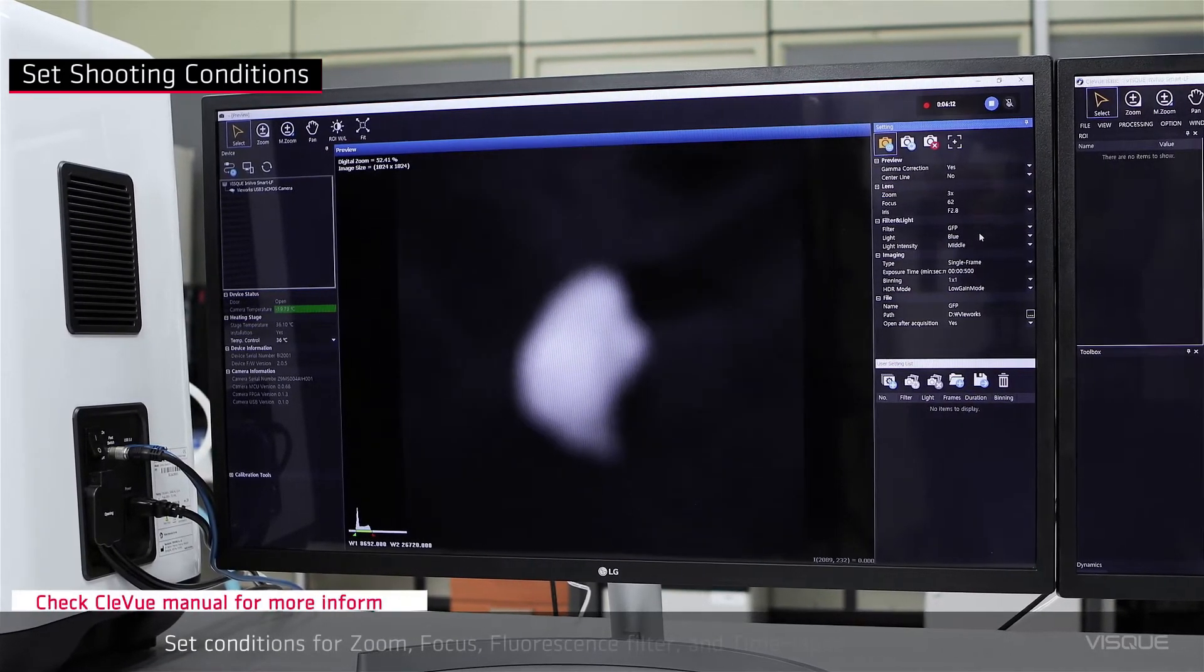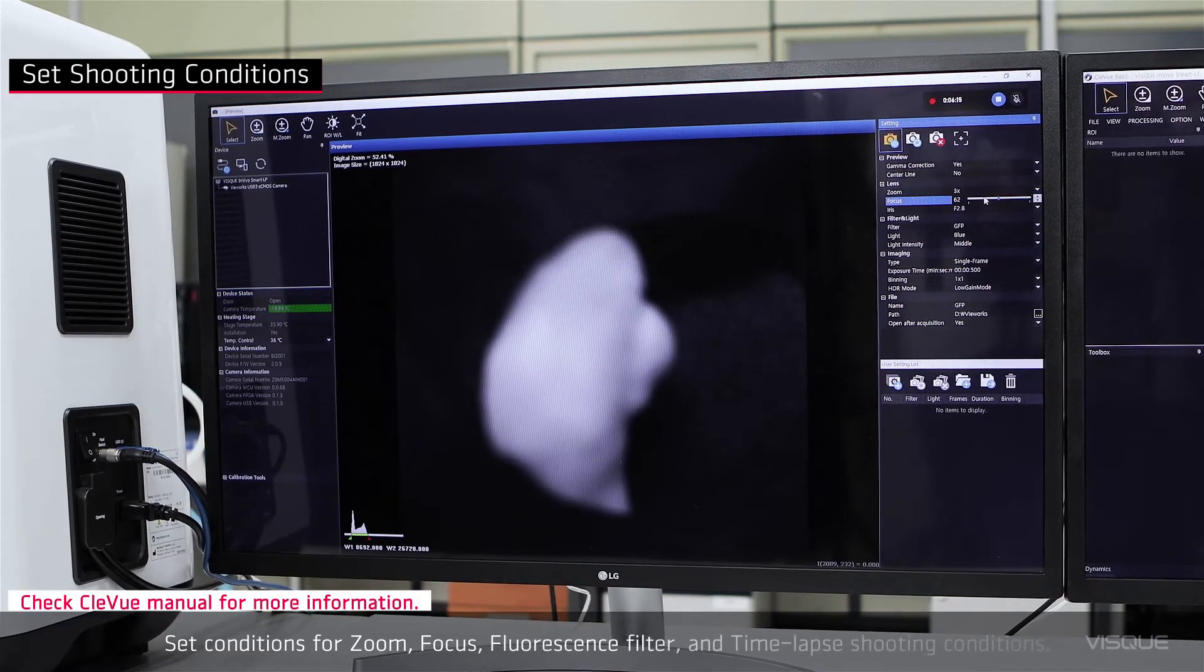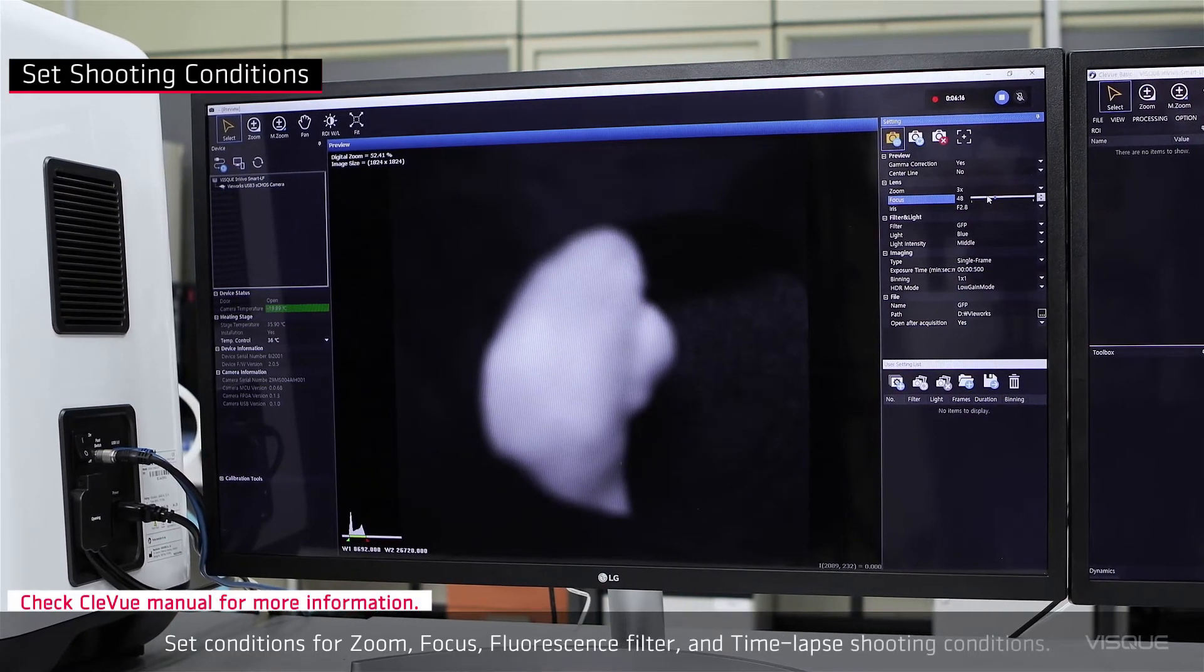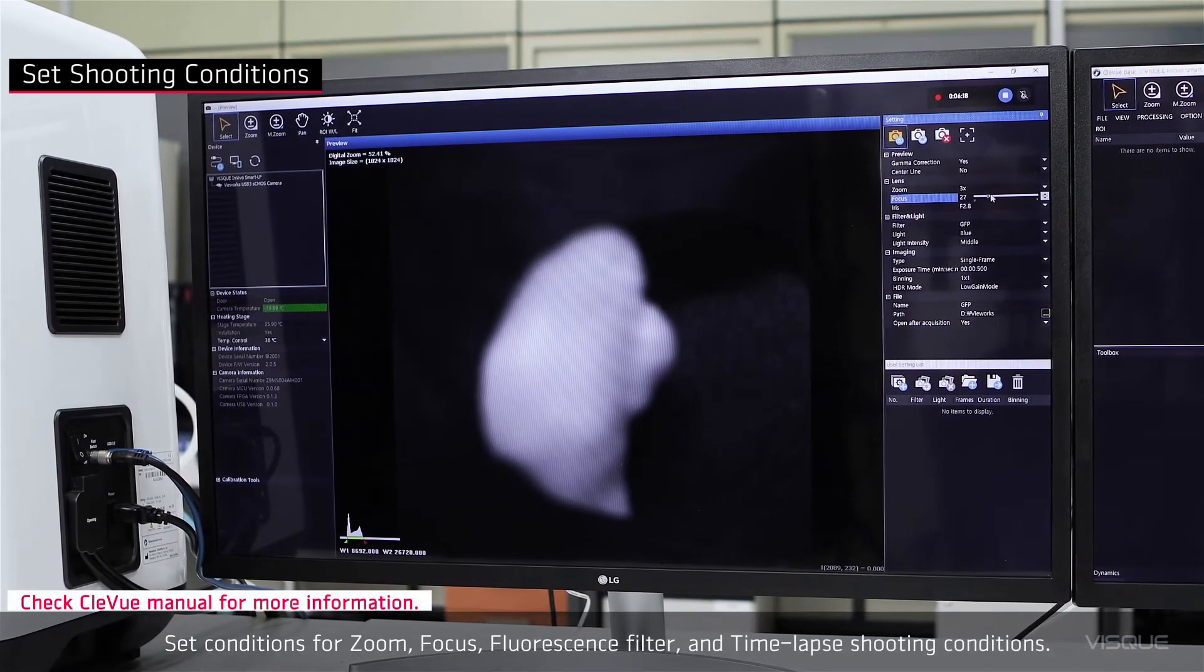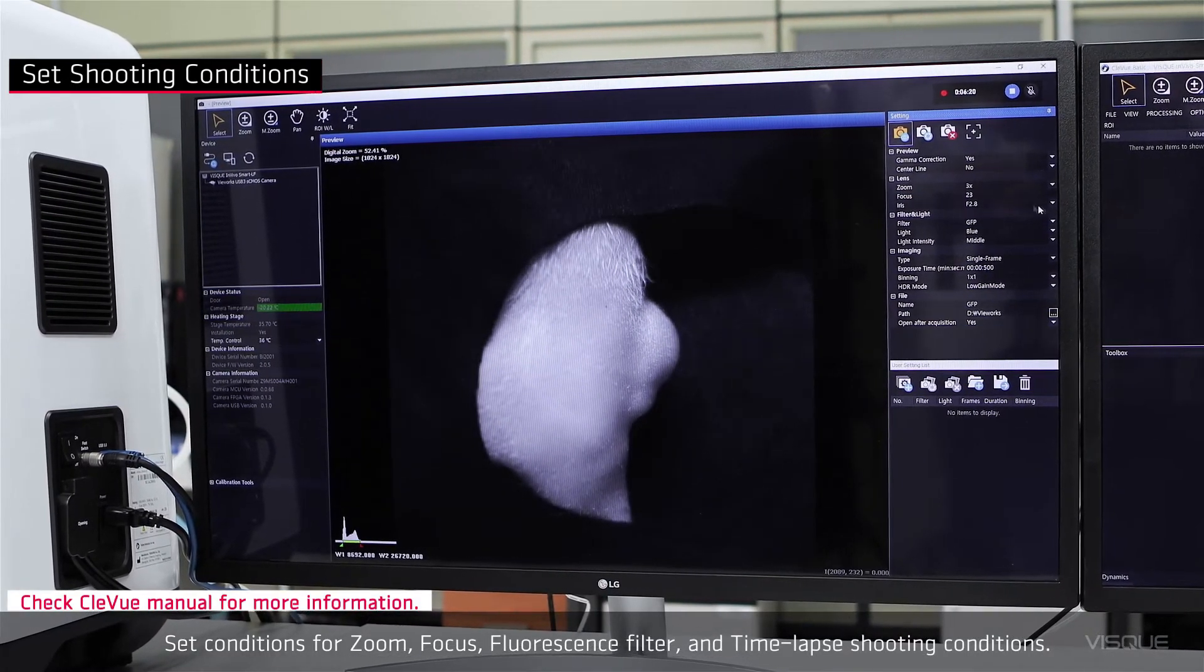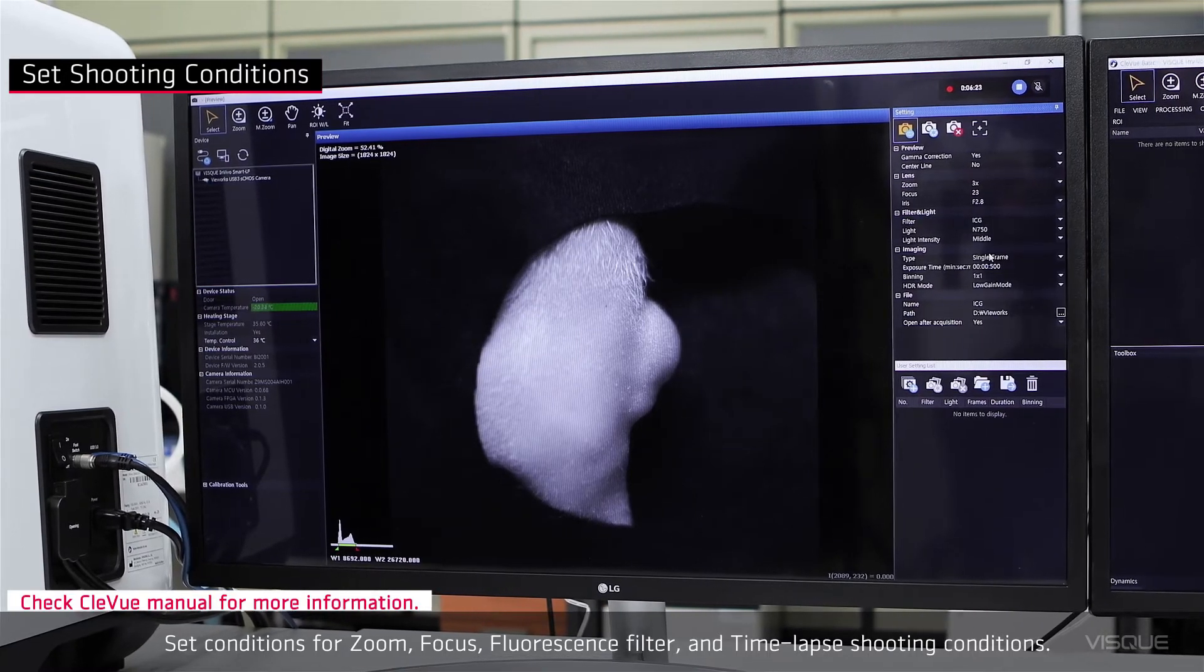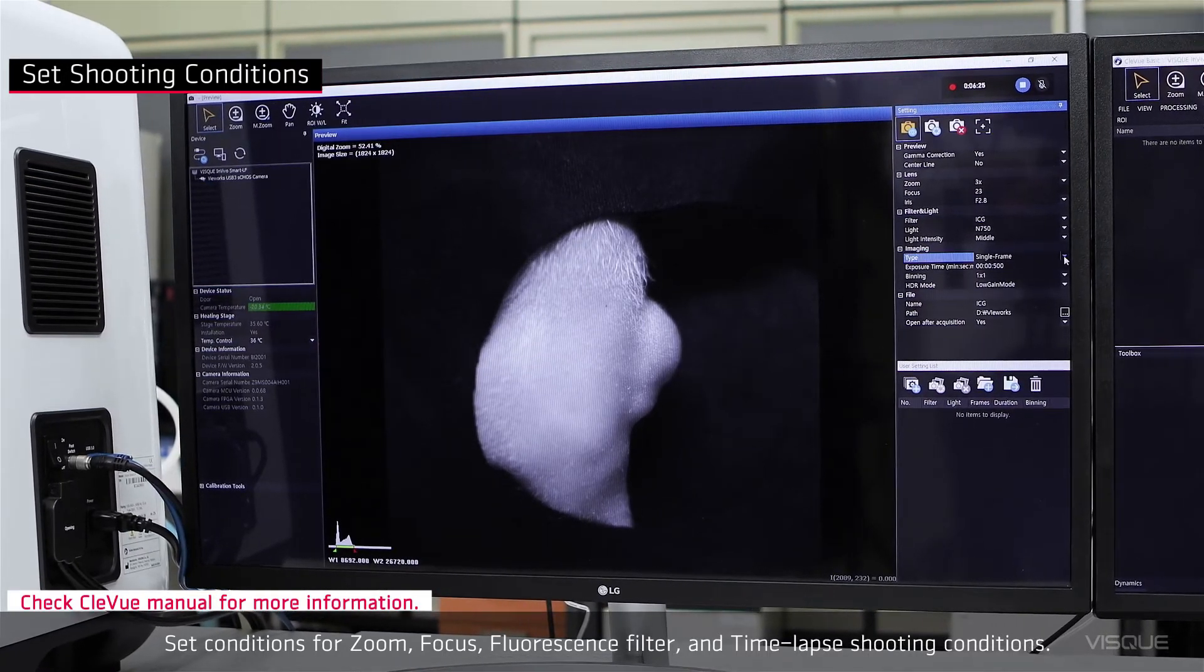Set conditions for zoom, focus, fluorescent filter, and time-lapse shooting conditions.